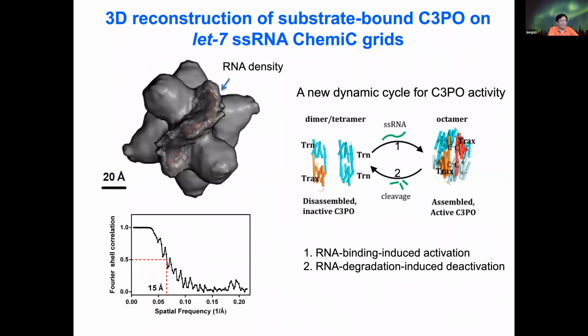You don't have to know the details about the specimen. The general idea is that using this method, we can build a data set of particles in different orientations and then perform three-dimensional reconstruction. This is actually just to show that even though the resolution is low, the data is suitable for three-dimensional reconstruction. In principle, this can be optimized using a large number of data sets to reach atomic resolution. We are actually in the middle of doing that.